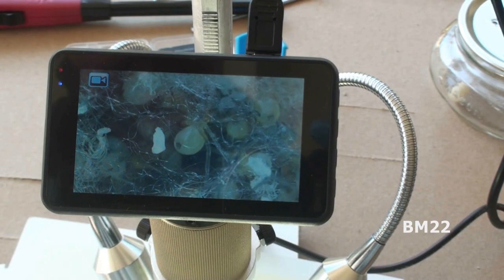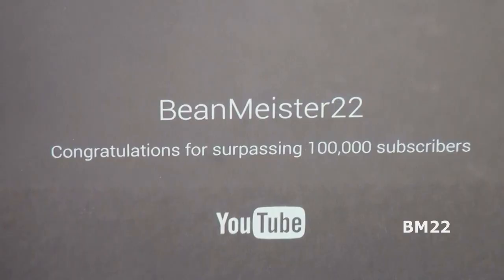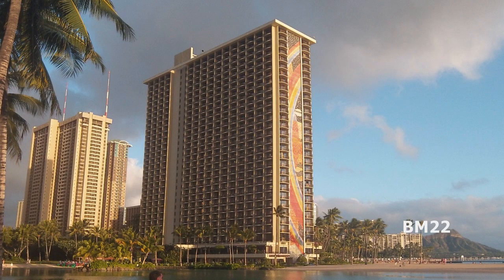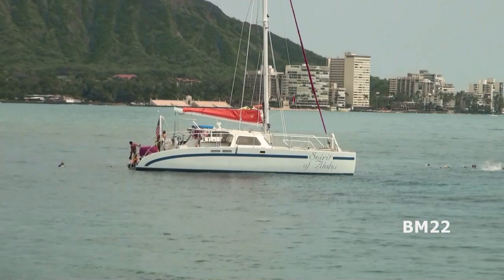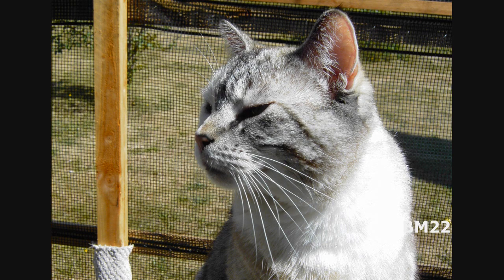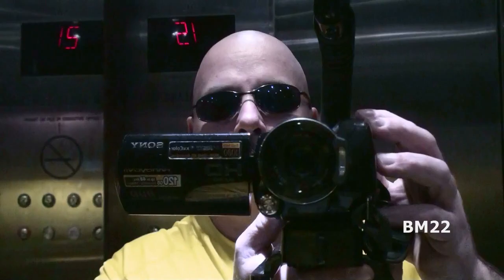But before I've made my review video, I don't want you running out and saying it's really cool, I need to buy one of these and then think you can look at pollen, little things of pollen or blood vessels or blood cells or germs or any of that, because you're not going to do that with this microscope. But for looking at things that are small and making them really big and videoing on them and you can take still pictures too, I think these are really cool and I am really impressed, at least with the KK Moon one. The other one, well, I already told you. All right, so what do you think? Cool? Not cool? Leave your comments in the comment section. And hey, as always, thanks for watchin'.